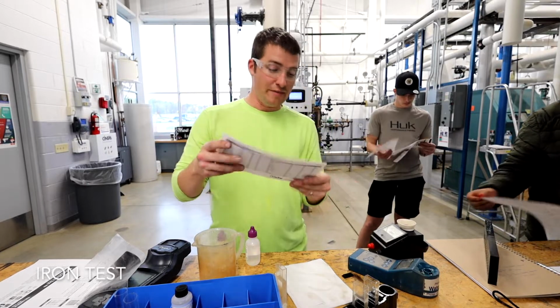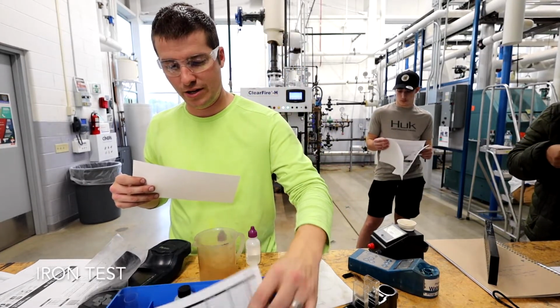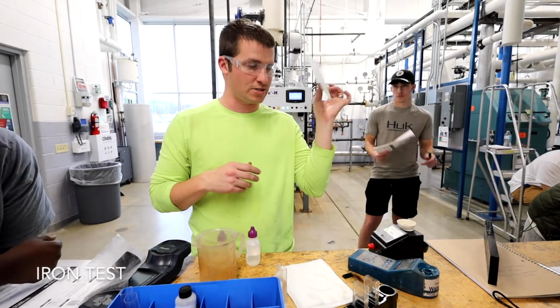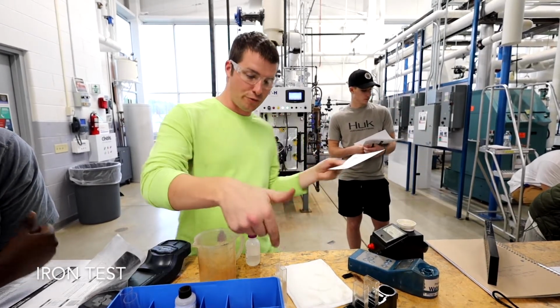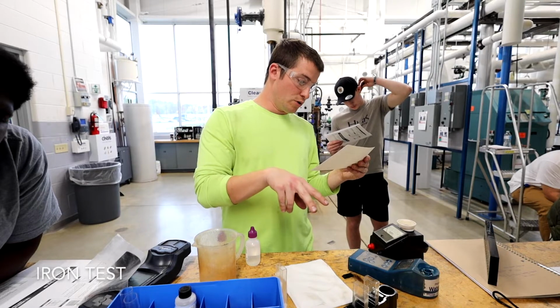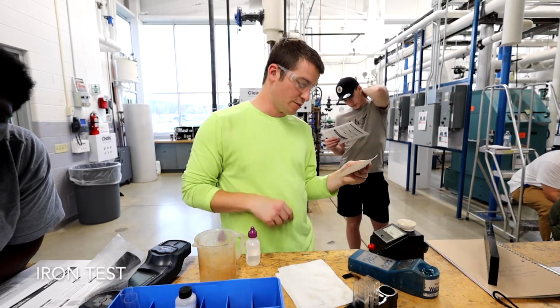So again, this is good to have. The rest is more long-winded and you don't care. What I'll do is put a star with a Sharpie. This is the test instruction in this kit. You'll go to this one right away. So rinse and fill 3 vials, right? Like we did to 11.5 mil. Put all 3 in with the frosted side facing you.